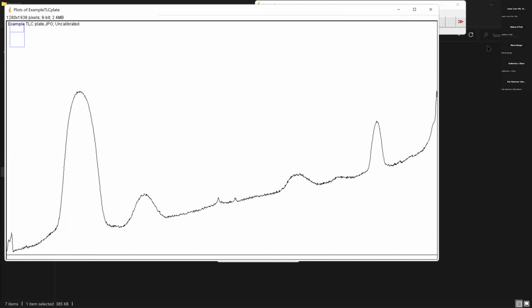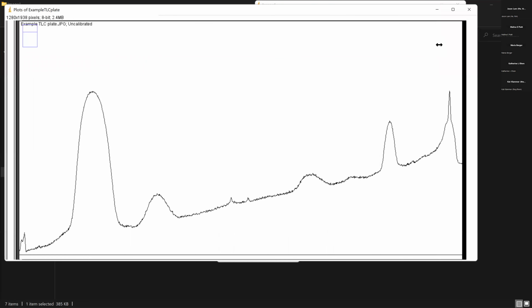in chromatography in general. You're going to see something similar to this next week when we do vitamin D analysis. So this lab kind of gives a good view for you guys of how we actually get these HPLC peaks, or chromatogram peaks, sorry. So this is going to show us each one of those dots.